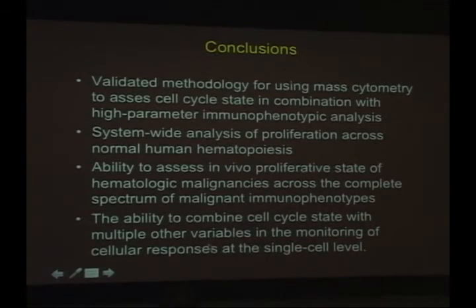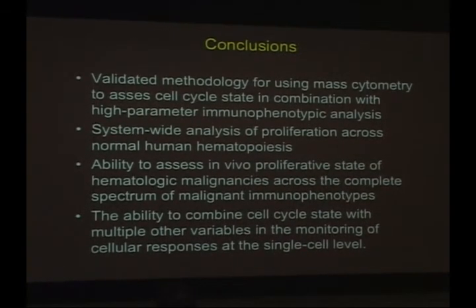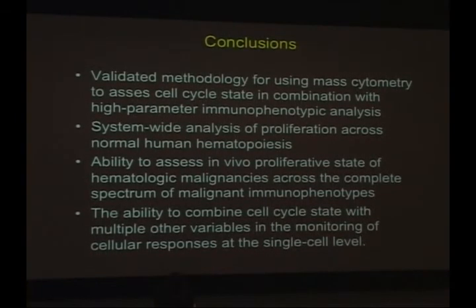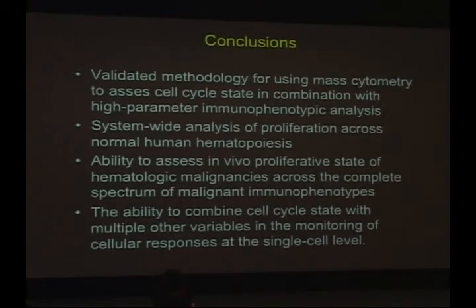And that's a great lead into Harris's work, because he's used this cell cycle to look at how cell cycle correlates with apoptotic signaling. But you can see how cell cycle correlates with all sorts of signaling states that you might be interested in.